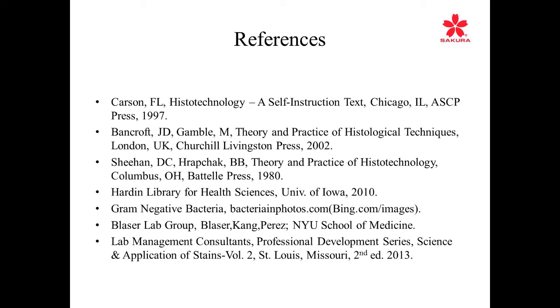So once again, the purpose of this lecture today was to give you basic understanding about microorganisms and their identification, their morphology, and their staining techniques, how one microorganism differentiates from another, and how important it is to be able to do the stain optimally so that the pathologist can visually validate the type of organisms that he thinks it is.